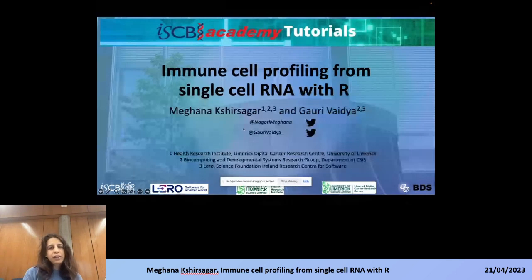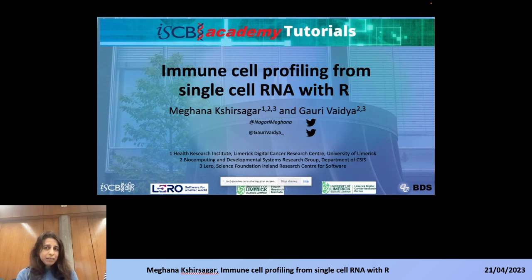In today's session, along with my PhD student Gauri, we are going to discuss guidelines on how to set up single cell experiments, how to do it in a way that can really make a difference, and how we use these results and build up from them.